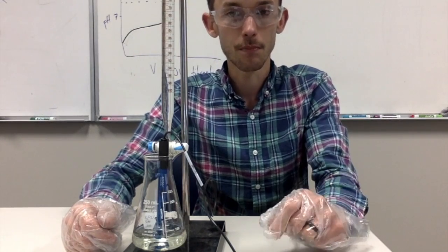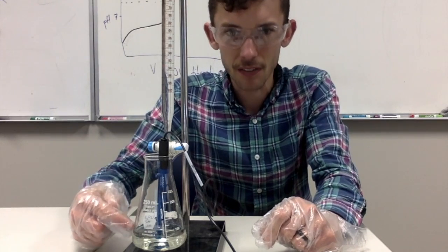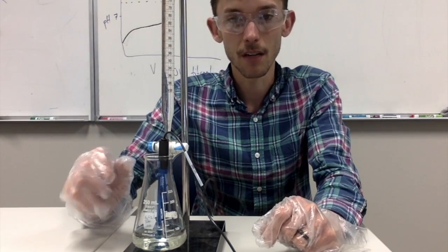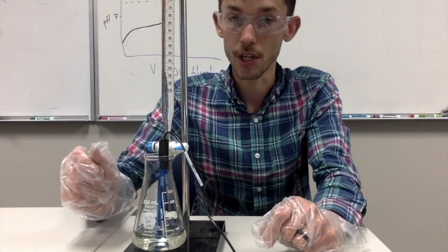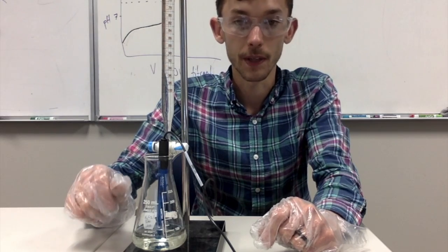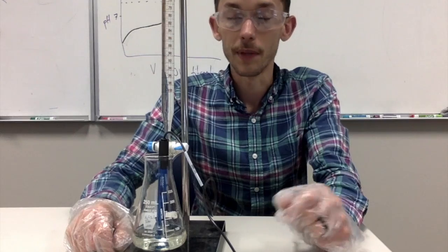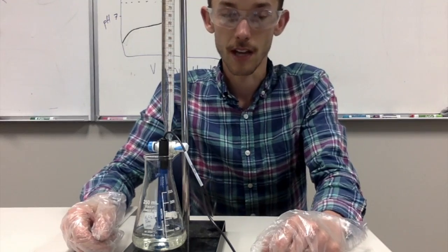Doing this, we should be able to see the midpoint. We should be able to see the equivalence point. I also have an indicator in here. You may notice, if you look very carefully, this is the tiniest little bit greenish yellow. I put an indicator in here called bromothymol blue, which is a little bit yellowy whenever something is very acidic, but as something becomes basic, it changes to blue. And it'll change to blue when I get near the equivalence point of this titration. So whenever this is a deep blue, I know that I'm at the equivalence point. Makes sense? So next time I see you, we'll have a nice little blue solution here, and I will have generated a pH curve, and then we can analyze that.